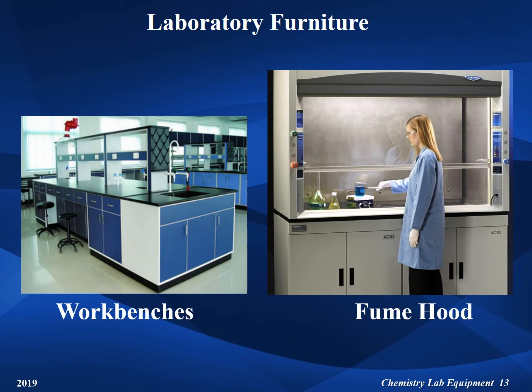Note that the chemist in this photo is protected by wearing safety glasses, gloves, and a laboratory coat. She is also holding the hot beaker with a pair of tongs.